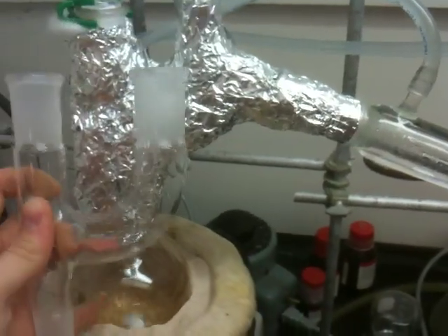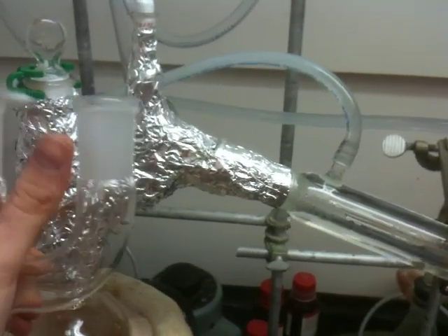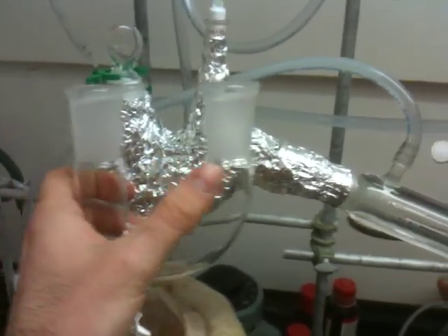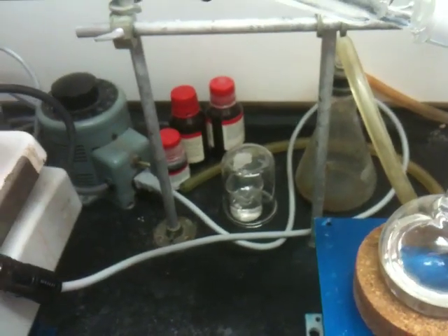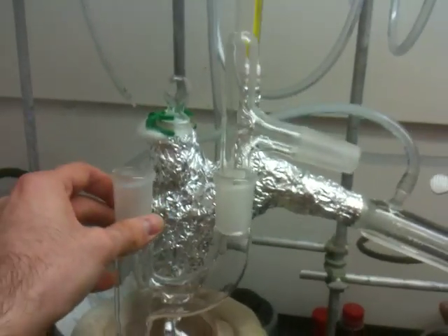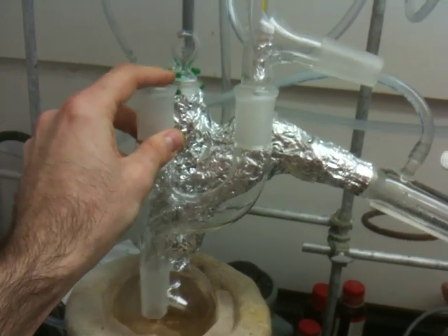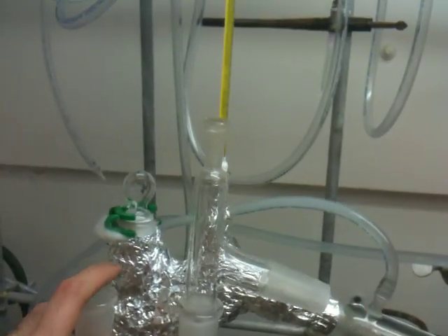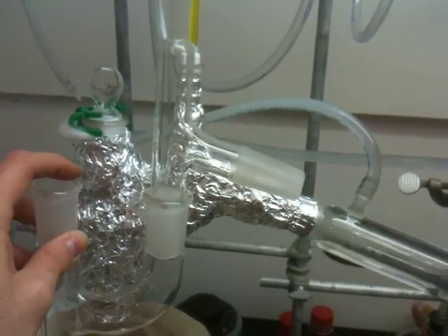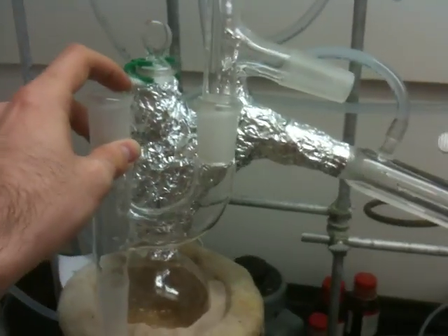Even if everything boils suddenly and everything bumps, this joint — this U-shape — doesn't let it go to the collection flask. The combination of these two would be like this: you connect your flask in here and you have a stopper here. The right one is connected to the condenser and the top one is connected to a thermometer. So this is a little bit better and safer setup.